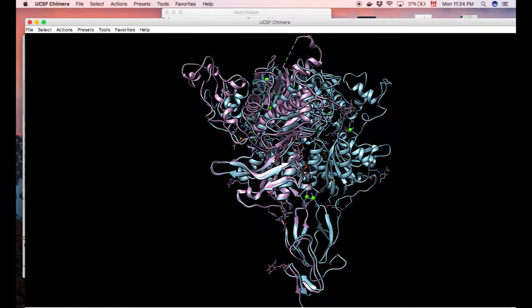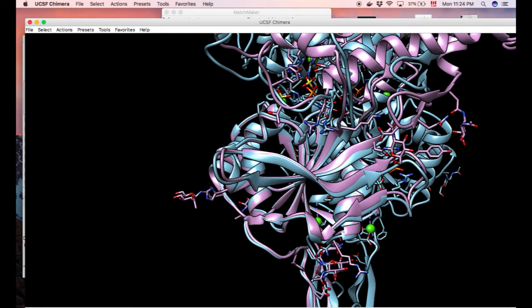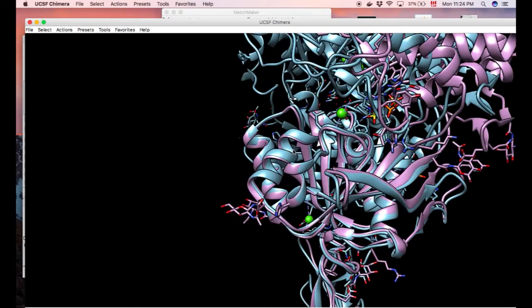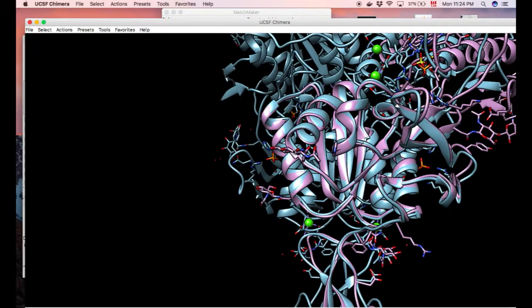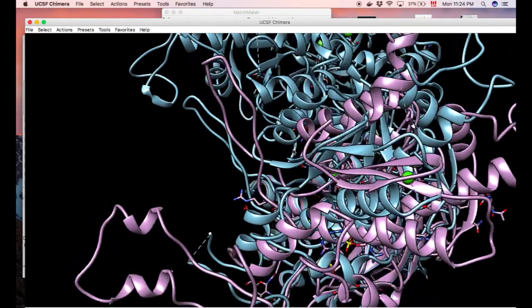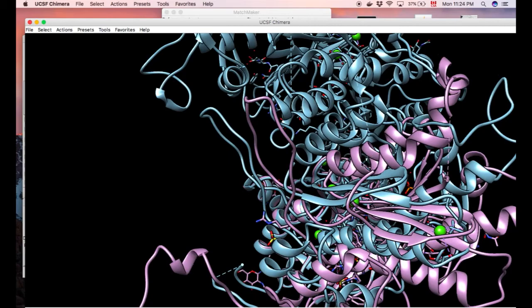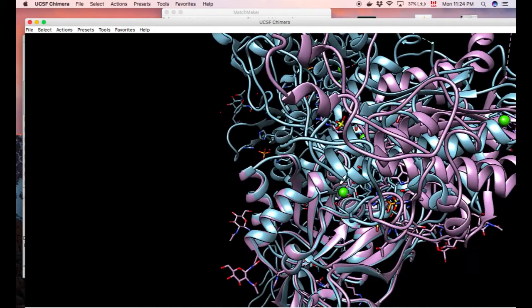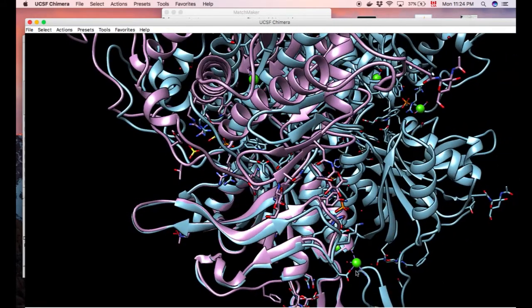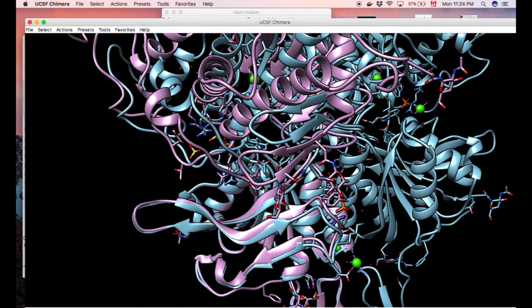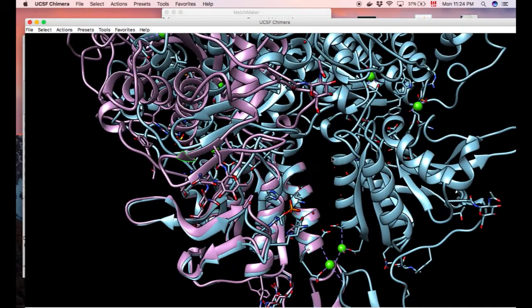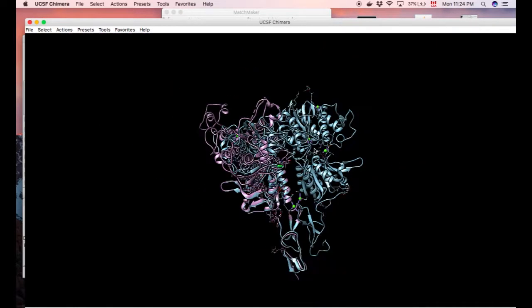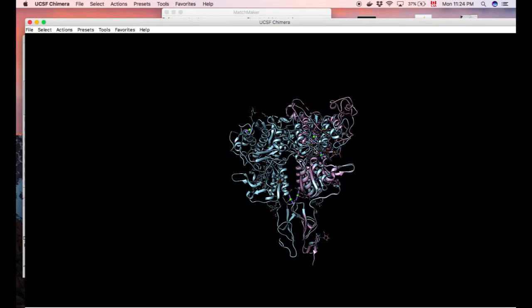Of course, it's a dimer, but let's concentrate on this part. You can see that this nice series of beta sheets is highly homologous here. We're having a little bit of difference. I said there were different conformations, but you can see that there's just a shift. So this is going there. This is going there. You see here, this is going, this part, this part is going here. This part is coming here. So they're very, very similar.